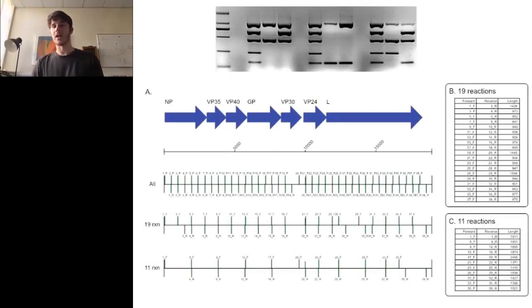So PCR, you probably will have heard of the polymerase chain reaction. It's basically a technique where you start off with a small number of templates, and using small oligonucleotide primers, you generate billions of copies of that template that you're interested in. It's quite a robust technology, but it's also very sensitive.